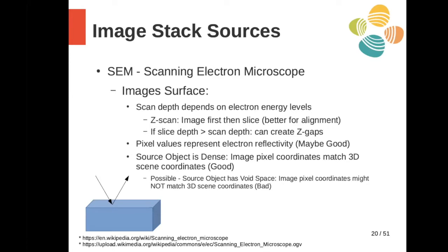So that's good. A possible complication is that the object may have void spaces and you may be seeing deeper into the sample at a particular slice. And that's going to throw off the segmentation algorithms.